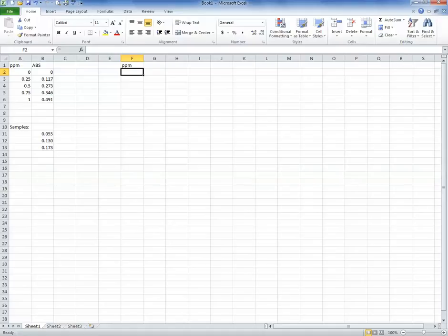The reason is that molarity, which is noted with a capital M, is a very common concentration, but the problem is that what we do in the laboratory is so small, concentration wise, that sometimes these molarities are very, very tiny numbers. 0.0000 is not uncommon for us to see.